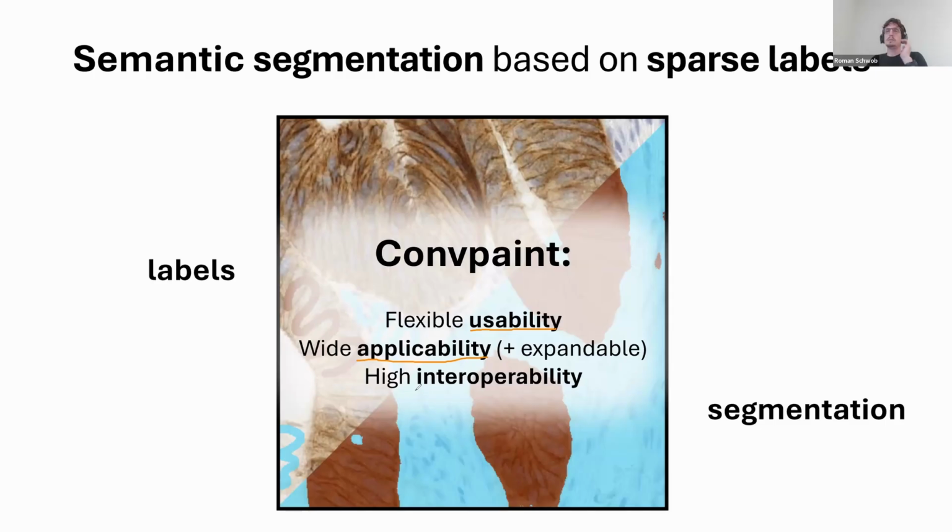I'm mostly going to talk about the Napari plugin today, but we also have an API, so you can reuse it with other tools that are working with Python, or also in Napari, obviously.